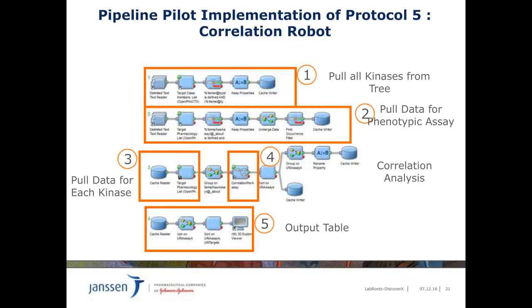In step 2, second line, the assay data for the example pre-Lamin A splicing corrector assay is pulled using the target pharmacology list call. In step 3, we pull for each kinase of the kinase tree the available pharmacology data using the target pharmacology list call. And step 4 does the correlation itself. In the shown example, we do the most simple correlation type by just counting the number of hits common to an assay pair. Here, more complex correlation functions can be used when the data is less sparse, like for instance corporate screening data or full HTS decks.